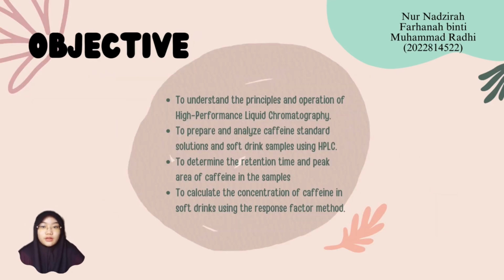The objectives of this experiment are, first, to understand the principle and operation of high-performance liquid chromatography. Second, to prepare and analyze caffeine standard solutions and soft drink samples using HPLC. Third, to determine the retention time and peak area of caffeine in the samples. And lastly, to calculate the concentration of caffeine in soft drinks using the response factor method.